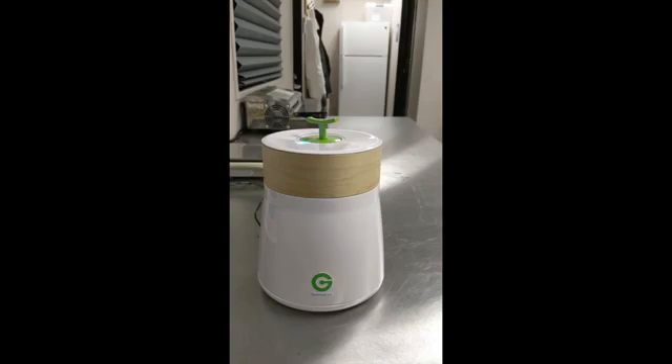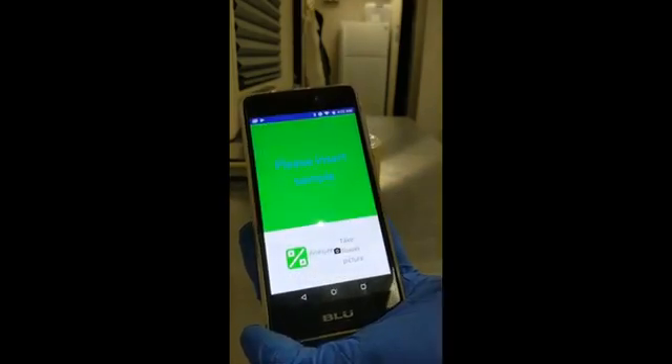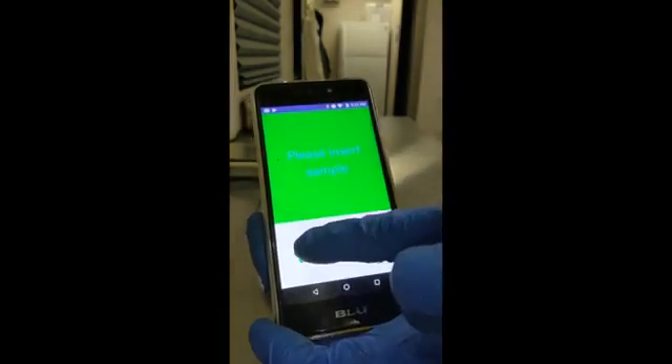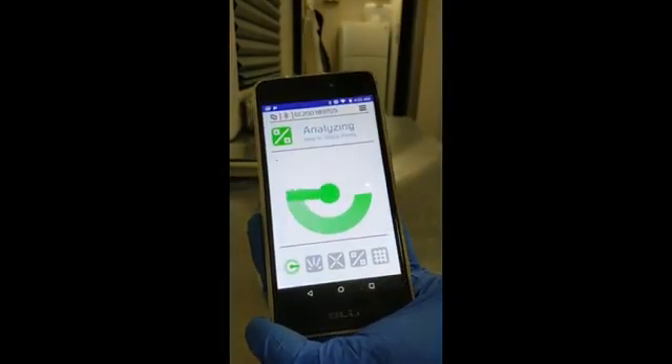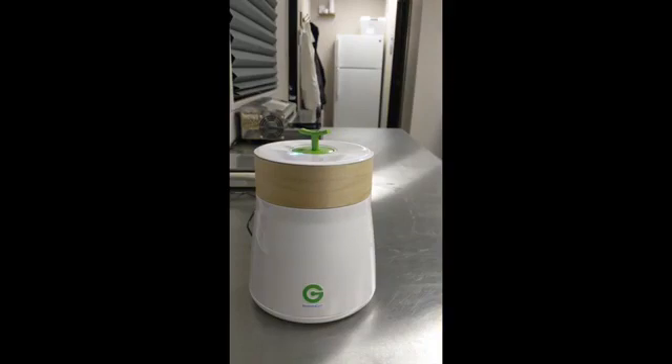You go back into the app and press analyze. It has an option to take a photo of the flower, then it goes into analysis mode. The analysis mode takes a couple of minutes to complete. Overall time with loading, unloading, and calibration is about five or six minutes per sample.